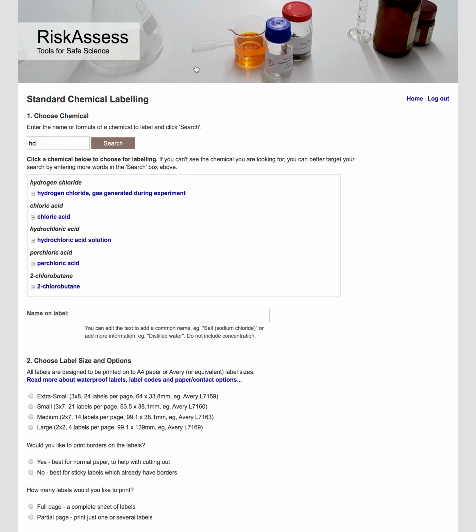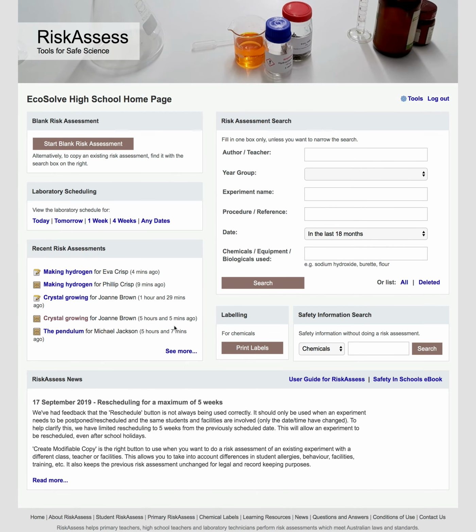Finally, let's look at the learning resources. First of all, there is my 250-page book on safety in schools as an ebook. Just click on it to find it on your home page. The book is licensed for unlimited use within the school. Then we have a range of learning resources. Just click on the footnote, and we also have questions and answers to help you.